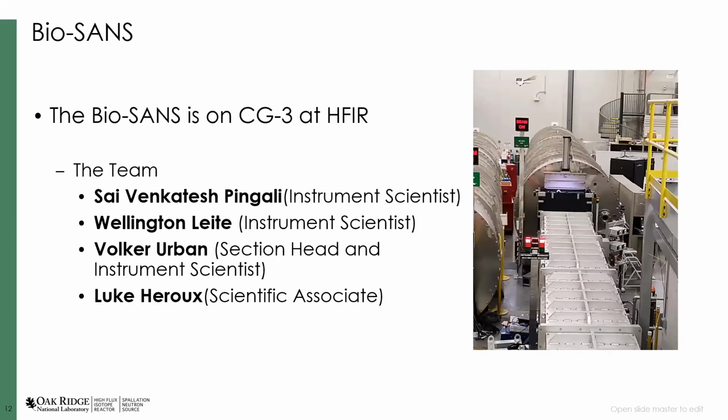Next instrument I'm going to talk about is the Bio-SANS. The Bio-SANS is the DOE BER funded SANS instrument. And you can see in the photograph here that it is sitting right next to the GP-SANS. These two instruments were developed at the same time. They were just funded through different mechanisms.